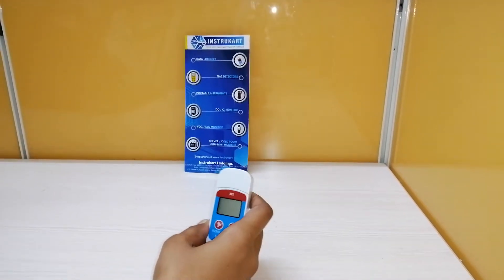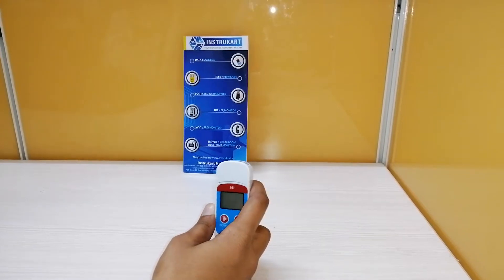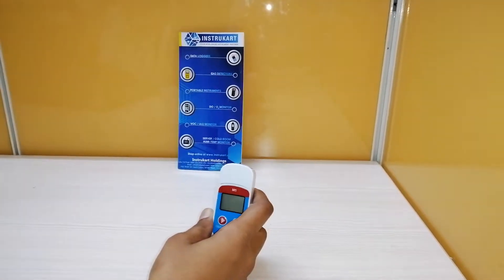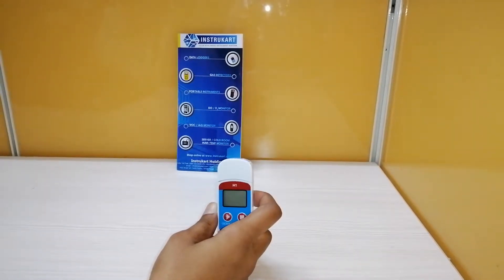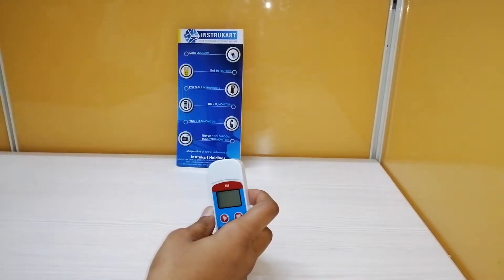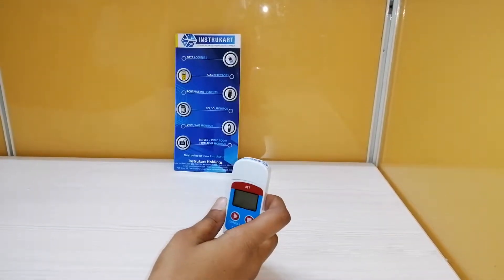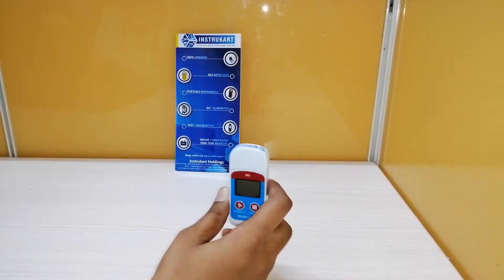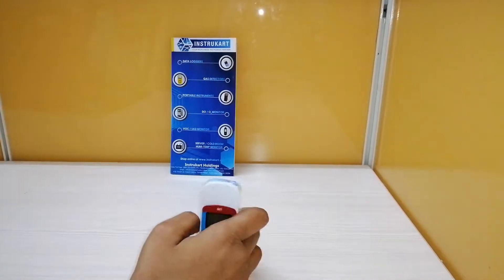Coming to the technical parameters, it has a temperature range of minus 30°C to plus 70°C with an accuracy of plus/minus 0.5°C. It can also record in Fahrenheit with a range of minus 22°F to plus 158°F. The recording capacity of this data logger is 32,000 measurements and it is ready to use.